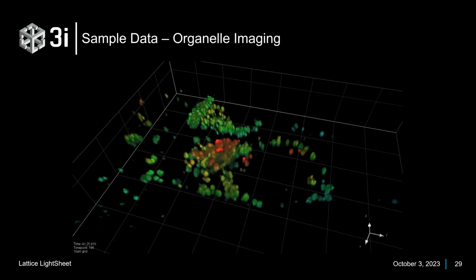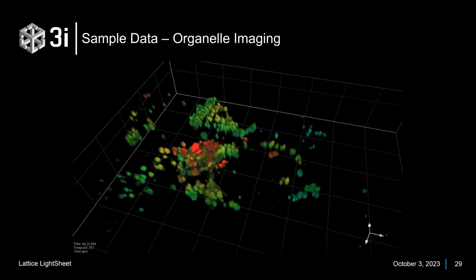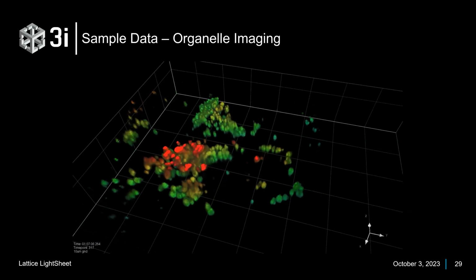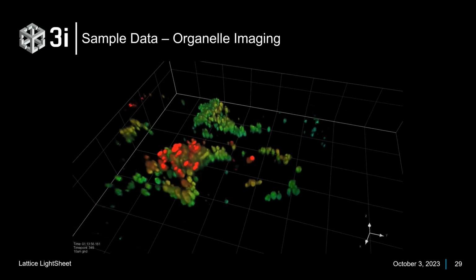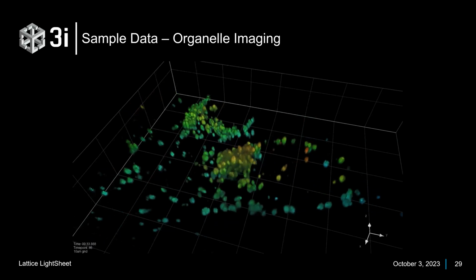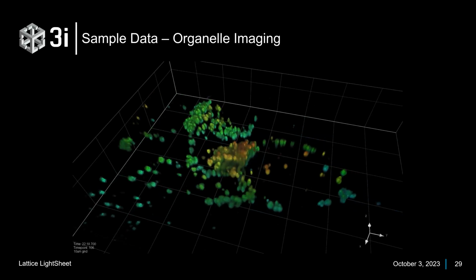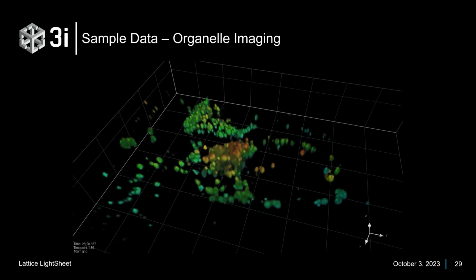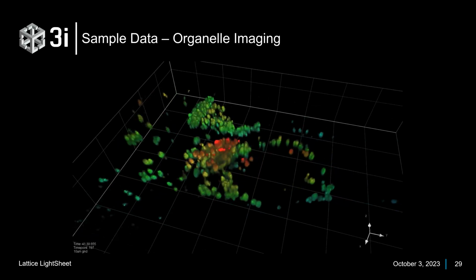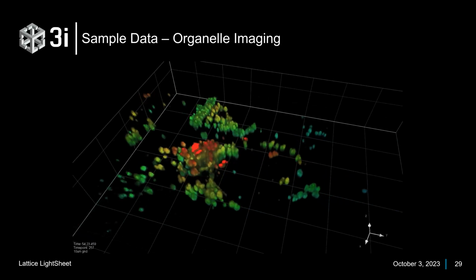This is an example of what some of our users consider the lattice to be: TIRF throughout the sample. It is not as thin as TIRF. I wish it was as thin as a TIRF field, about 150 nanometers thin. I loved our TIRF systems as well, but TIRF is restricted to the glass sample surface. This is not. You really can image anywhere you want in the sample with roughly the same axial resolution and sampling. So you get trafficking data that you might get in a TIRF sample, but now on the top of the cell as well as the bottom.